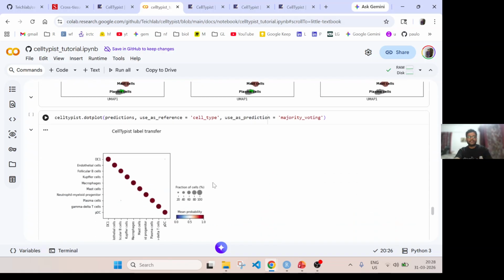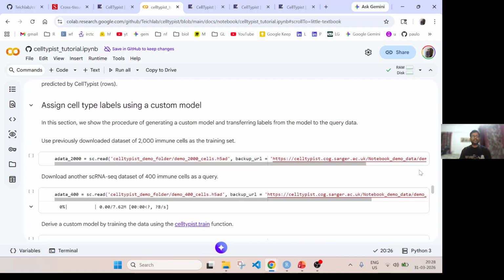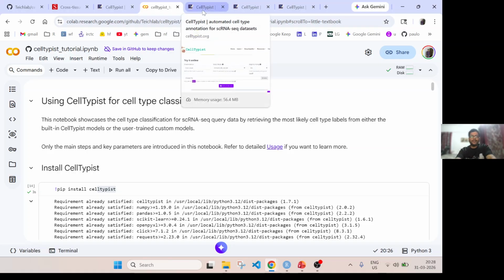Okay, so that way it is also useful if you have some data in matrix format, like gene by cell, or cell by gene in Python. They are just confused with R. The matrix, if you have it, should be log normalized. Then you can call the logistic regression training method to do that. Okay, so in short, it's not that complex if you're comfortable with Python.